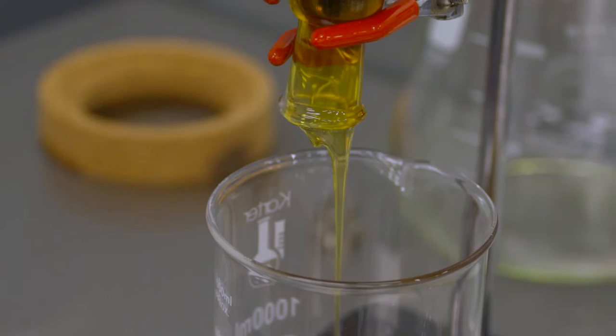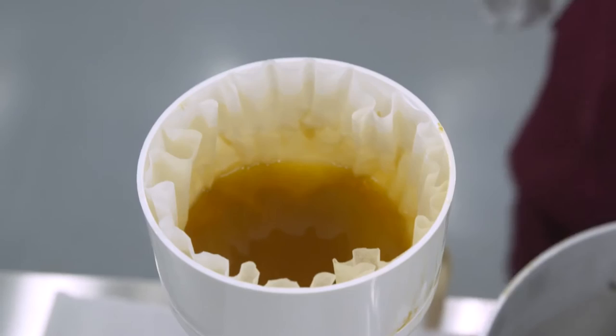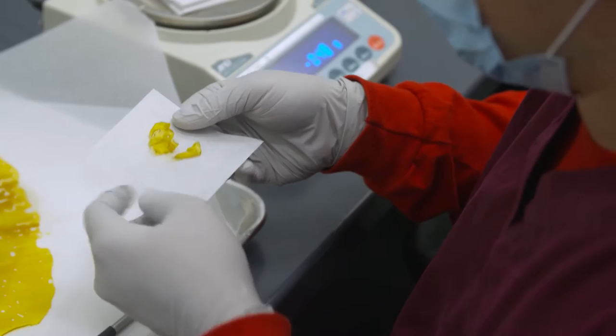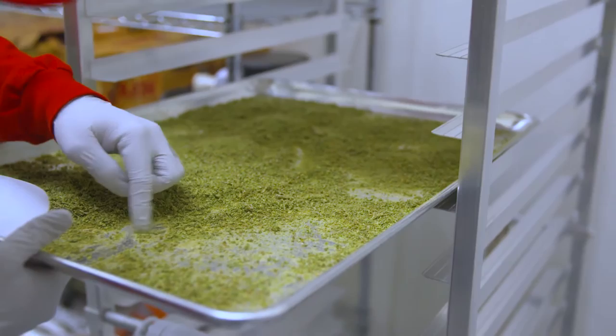Winterization is the process by which fats and waxes are removed from an extract that contains them. When plants are extracted, the medicine is inside a waxy envelope called the trichome. Some extraction methods dissolve not only the contents of the trichome but the trichome itself. Winterization was originally coined for use in the vegetable oil industry, where they chilled the oil and removed the solid fraction — so-called winterized oil. Applied to the cannabis industry, it is the process by which waxes and fats are removed from the cannabis extract.